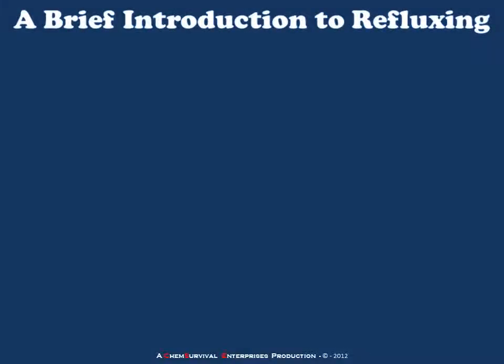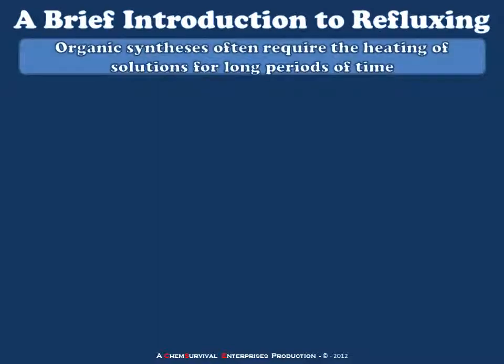Welcome to a brief introduction to the technique of refluxing. Now, before we begin discussing exactly how refluxing works, let's consider the problem that it can help us solve. And that is that organic syntheses often require the heating of solutions for long periods of time.